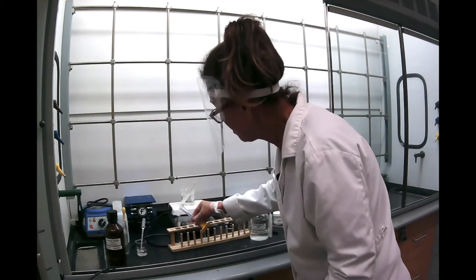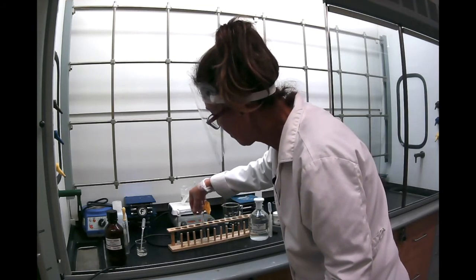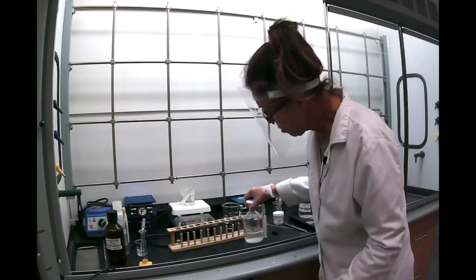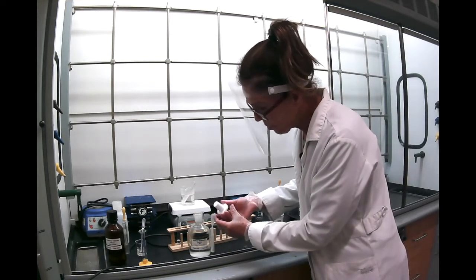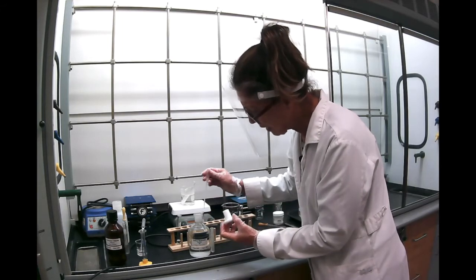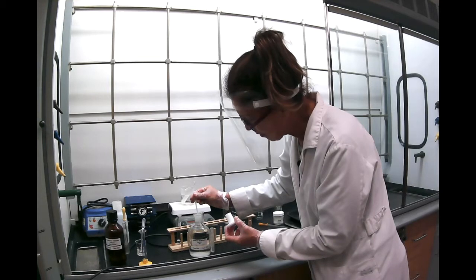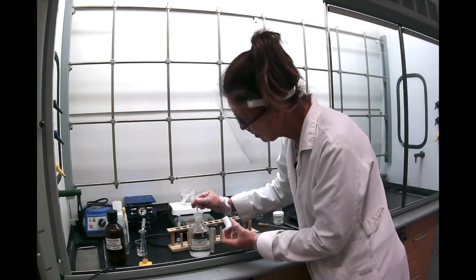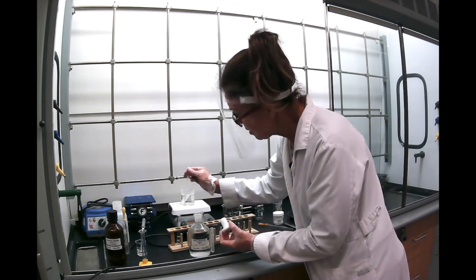And then I'm adding 2 milliliters of the 3 molar sodium hydroxide. So here we have 3 molar sodium hydroxide. I'm going to hold the cap here and just fill up 2 pipettes full of sodium hydroxide. This is 1, and this is 2.